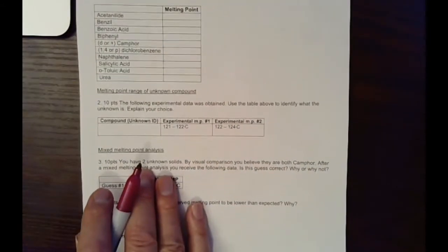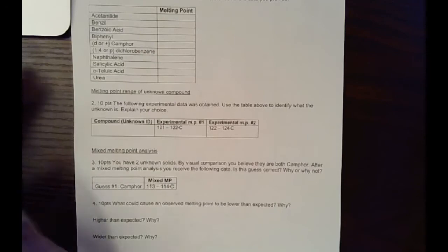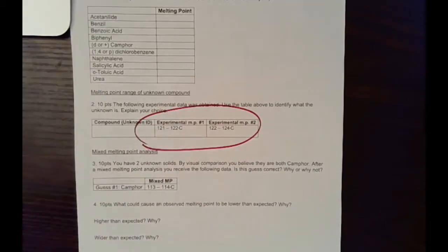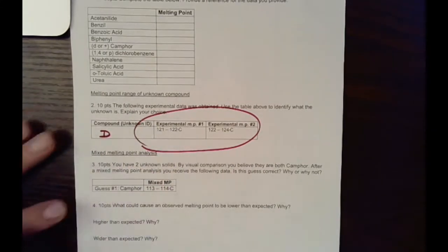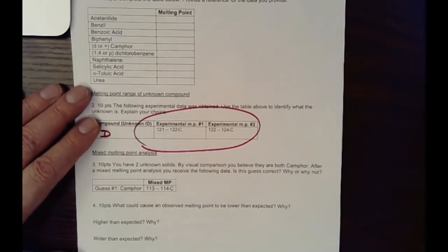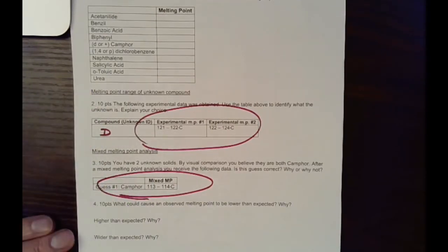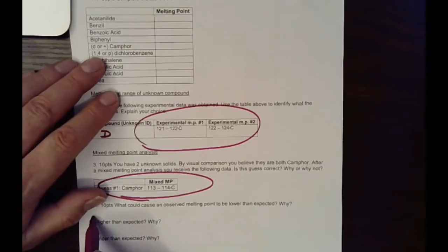Then here's what I was talking about. When you're doing this in the lab, so we're pretending you were in the lab and doing this in the lab. And that's what you got for your report for the unknown. Let's say this was unknown D or something. Then you did make, and you decided this was camphor, and you mixed it with camphor and not paying attention, and you got a lower melting point. But you still reported it as camphor. So I'd like you to correct that. And then there are some questions here you need to answer.